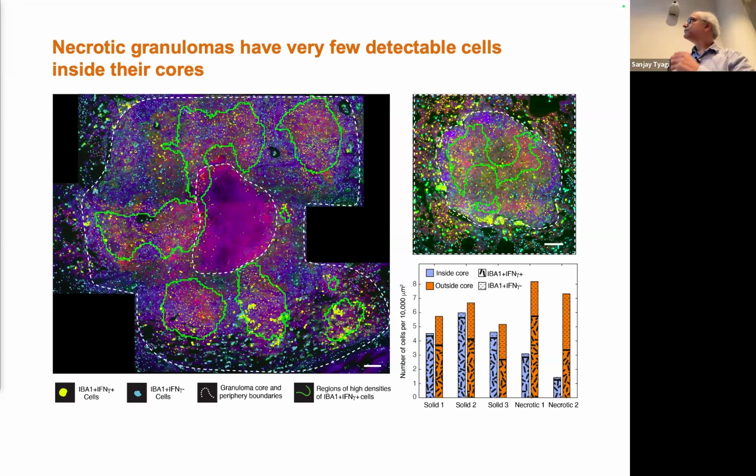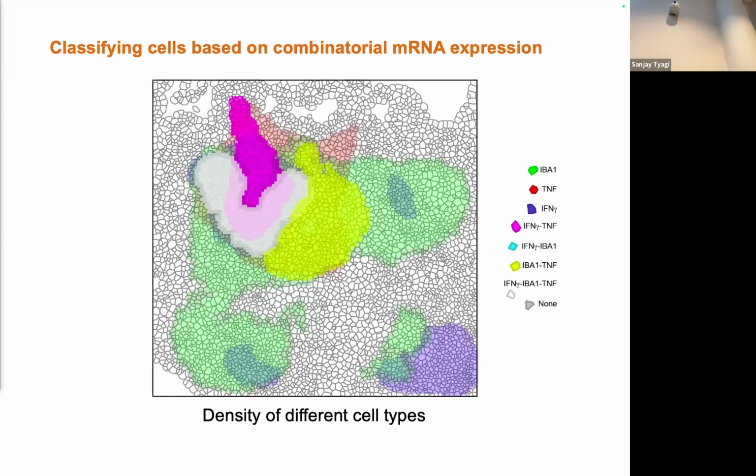These green borders that you see? Oh, so these green lines are simply a different way of drawing the density. So in this image, I drew the density by having the whole area green. In that one, only the periphery is drawn.